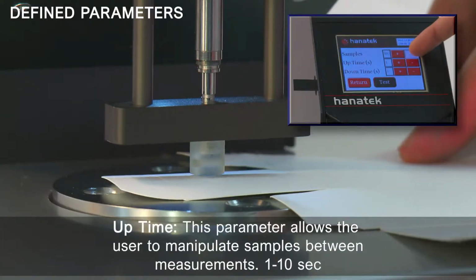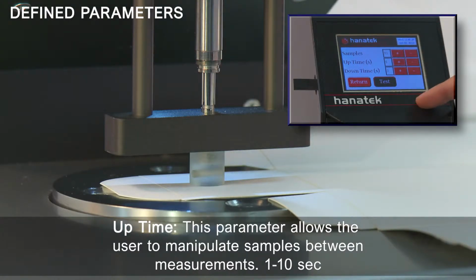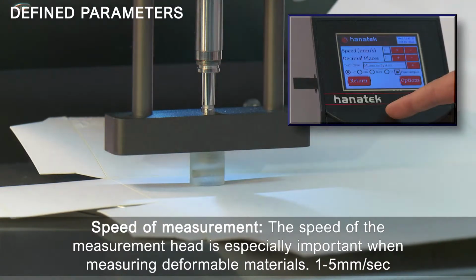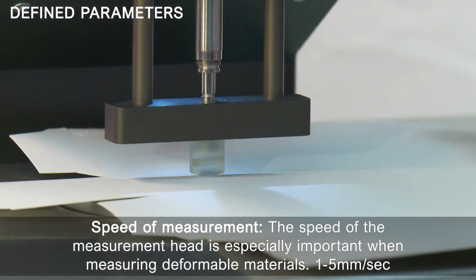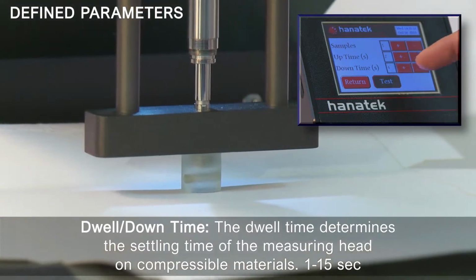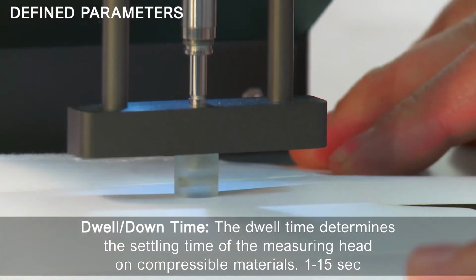Defined parameters. Uptime. This parameter allows the user to manipulate samples in between measurements between 1 to 10 seconds. Speed of measurement. The speed of the measurement head is especially important when measuring deformable materials and can be set between 1 and 5 mm per second. Dwell and downtime. The dwell time determines the settling time of the measuring head on compressible materials between 1 and 15 seconds.